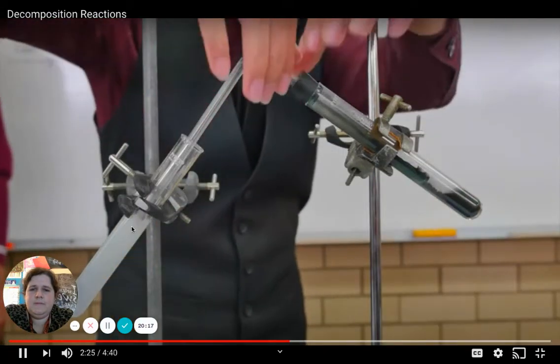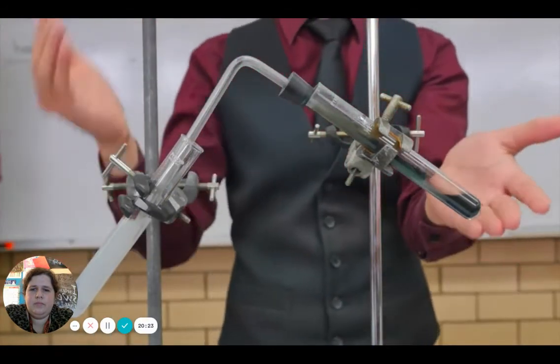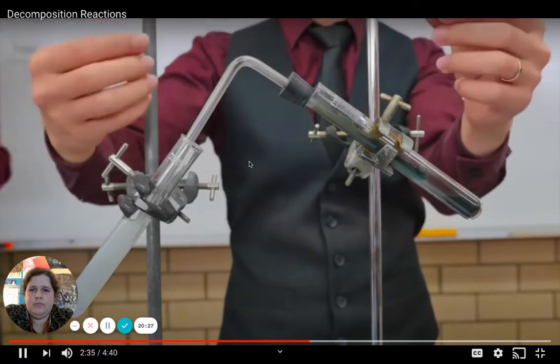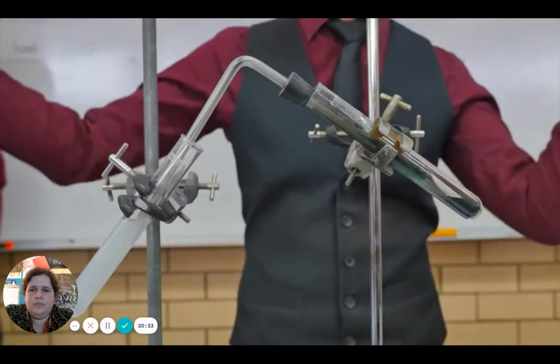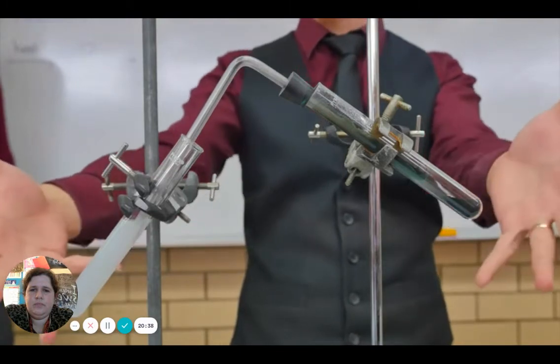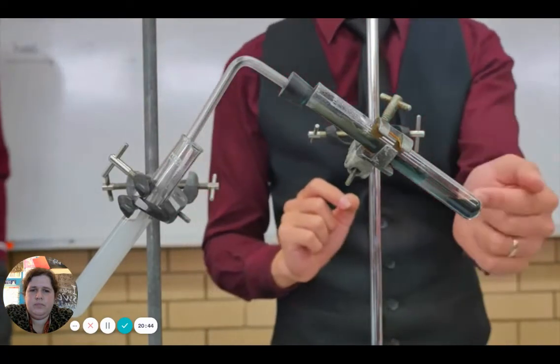Before everything goes wrong, I have to unplug it. What tends to happen if I don't unplug it is that I've created all this extra hot gas, so it's an expanded state. Then once I remove the Bunsen, everything cools back to room temperature. And what do gases do when they cool down? They shrink. Well, they come together. So it actually starts to suck up the liquid through the pipe and then down into here, which is not what I wanted, because I need to dispose of this.